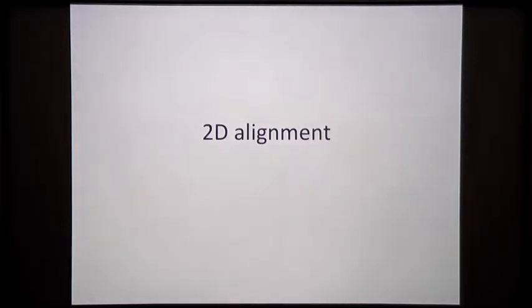So then what do you do if you have an incomplete data problem, which is our case? Now that brings me then to two-dimensional alignment. Intuitively, the problem is easy to understand. We just need to rotate all those penguins until they're all upside up. That's what we need to do. Okay?